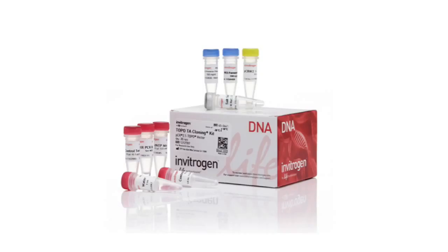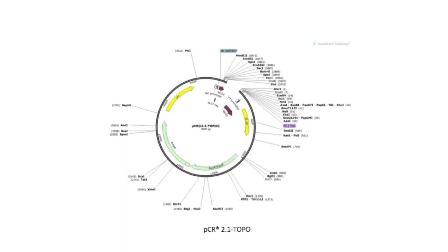EcoRI sites flank the PCR product insertion site for easy excision of inserts. It has kanamycin and ampicillin resistance genes, and easy blue-white colony screening for selection of recombinants. The elements that make up the vector PCR 2.1 TOPO are the following.